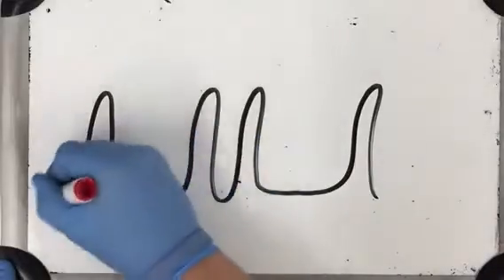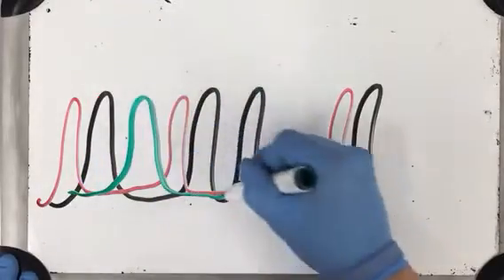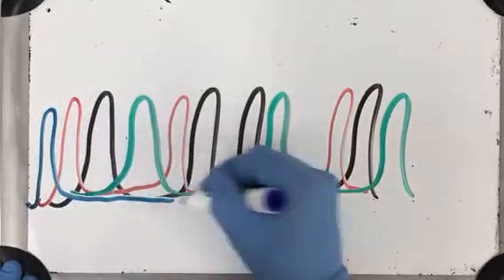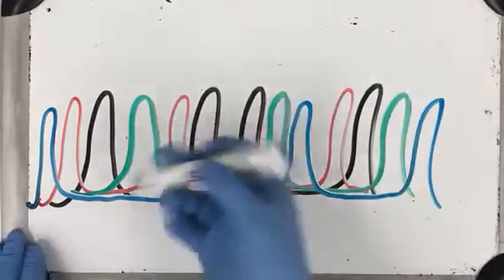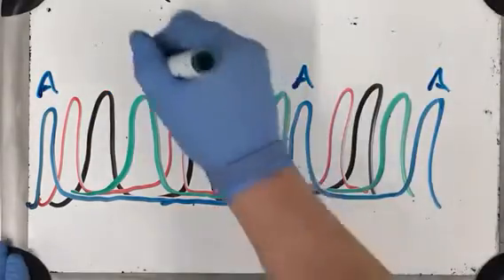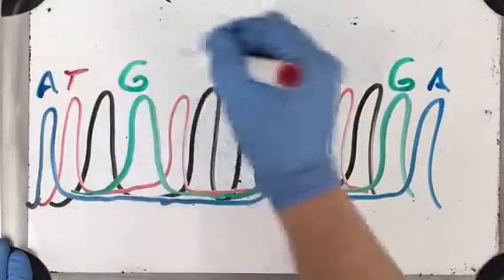Let's just do this. Oops, which one am I missing? Yeah, blue. And so if I correspond, I don't remember if these are the same colors. But each one corresponds to the same nucleotide. So this is how you can read it across. It's T.